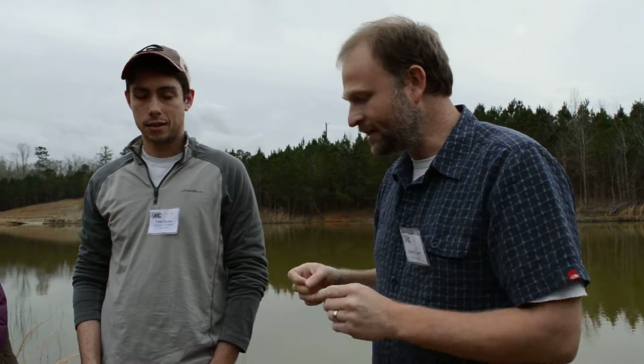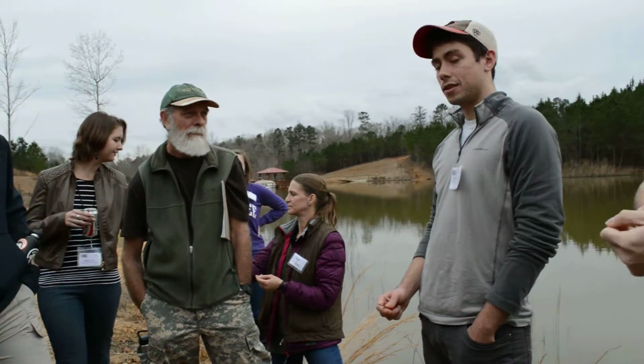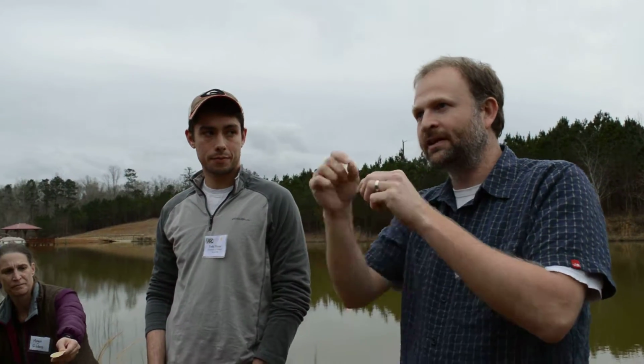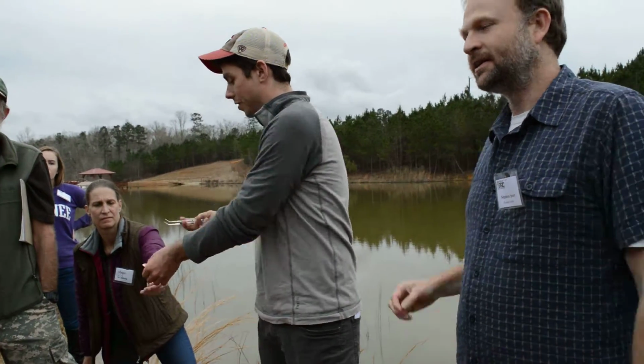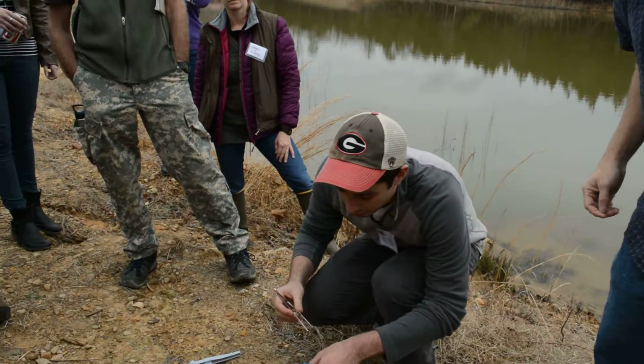So the way that I'll do it is you fold it over a couple times and fold over once more, and then it's neatly folded, and then when someone pulls it out, they can. Yes, and the curved flat edge forceps help a bunch.